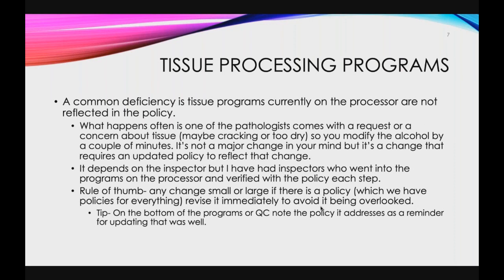For the tissue processing programs, a common deficiency is tissue processing programs currently on the processor are not reflected in the policy.